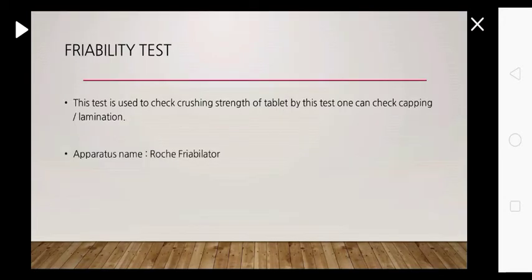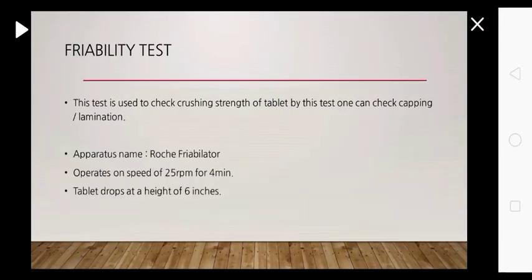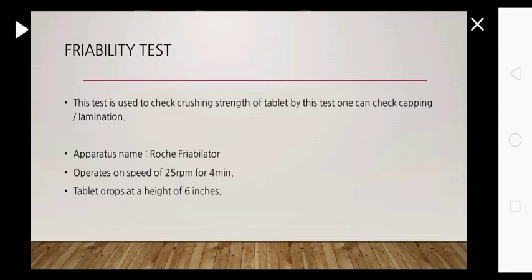Apparatus name is Roche friabilator. It operates at a speed of 25 RPM for 4 minutes. Tablets drop at a height of 6 inches.